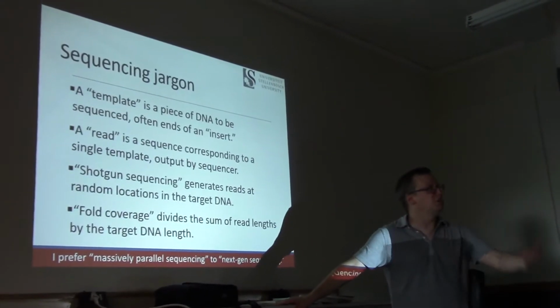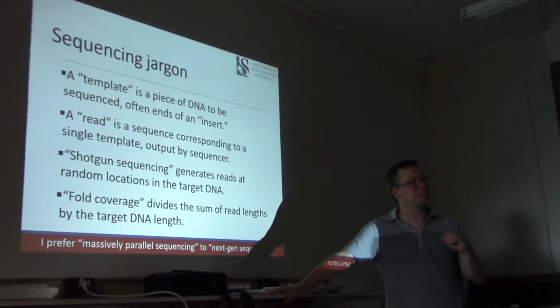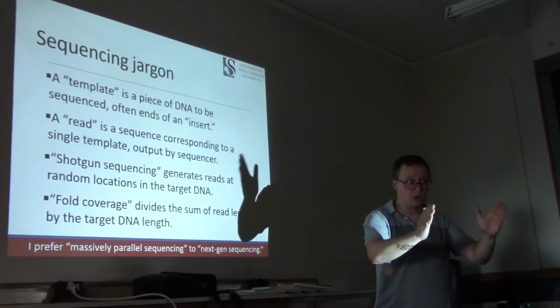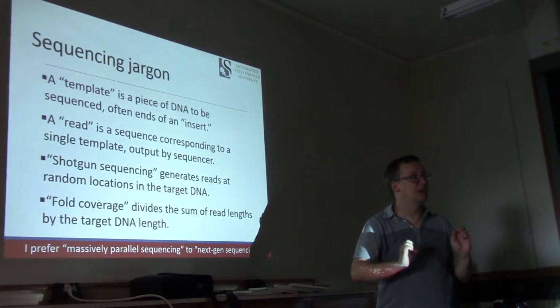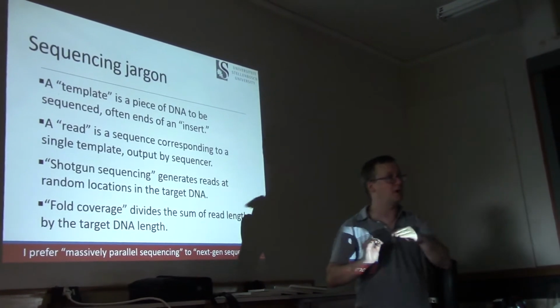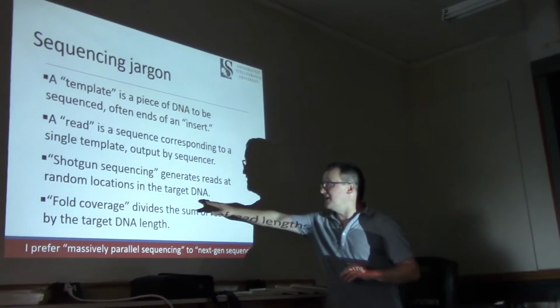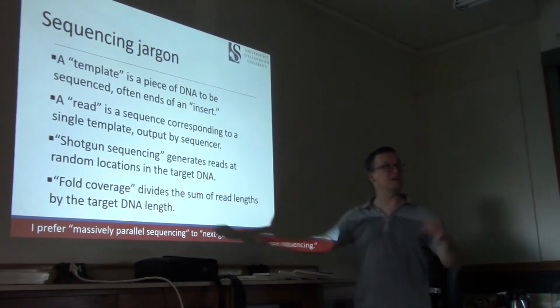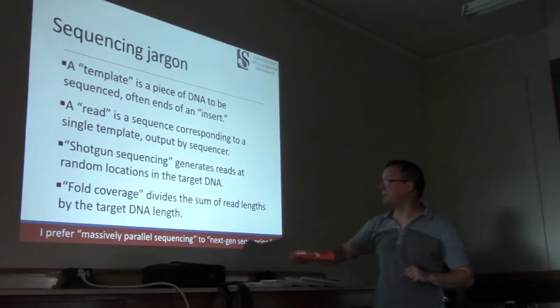Now, with whole genome shotgun, we assume that any deficiencies in our sequencing reads, they might be rather short because of the technology we're using, and they might have lower base pair quality. That because we're sequencing bazillions of them, that's going to be okay. We'll talk about how that plays out as we move into assembly.